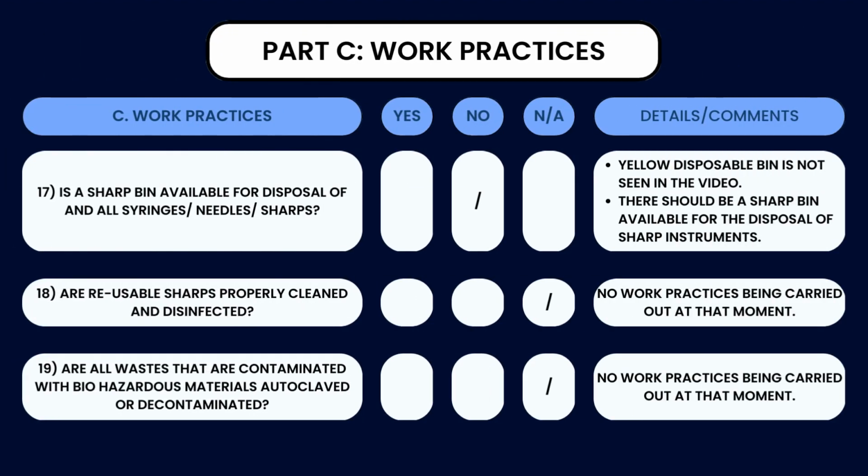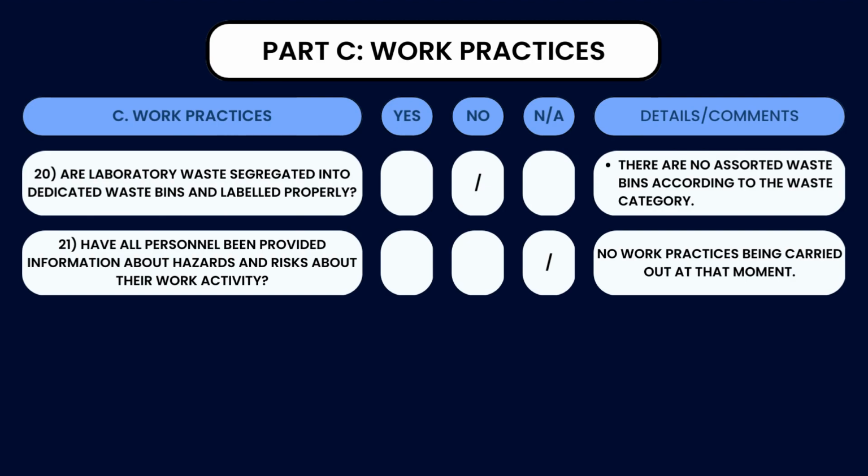Yellow disposable bin for disposal of syringes, needles and sharps should be available. The cleaning of reusable sharps and autoclaving of contaminated waste with biohazardous materials were not performed during the inspection. There were no assorted waste bins based on the waste category, and the personnel were not seen to be provided with information regarding working with hazards and risks.